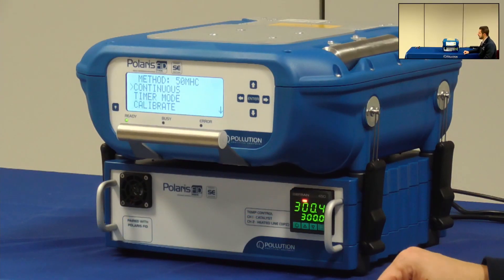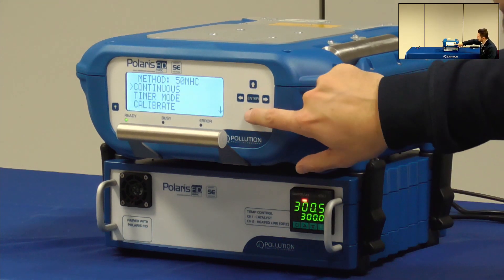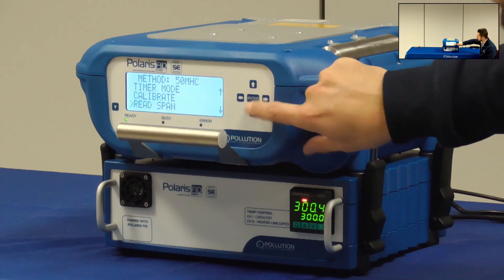Once the Polaris is on and ready to start the measurement, from the method menu I'll select Read Span by pressing Enter.